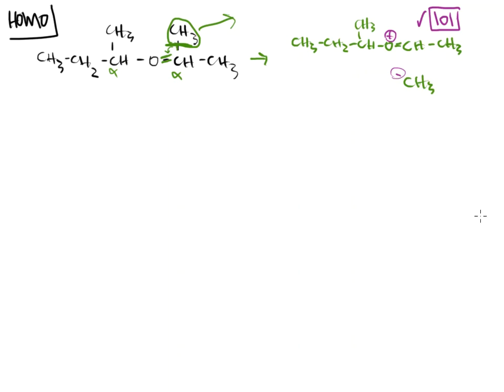All right, well, I'm not going to go through this again. Here's the alpha carbon. We chose to cleave it here up at the very top. Now we can choose to cleave it here. It's not going to change my structure though, because in the first case that we did, it released a methyl group. Off it went.